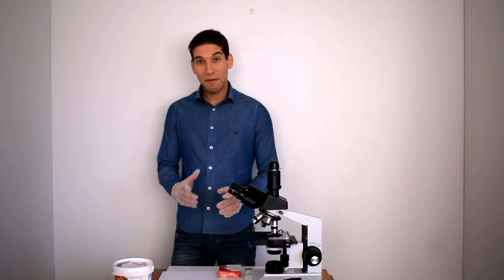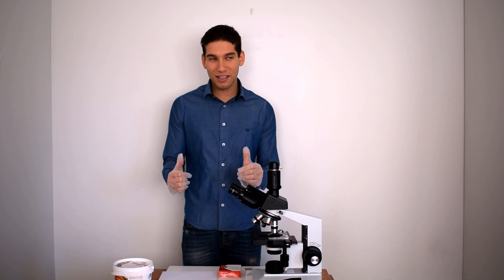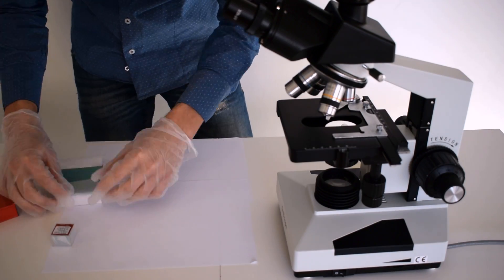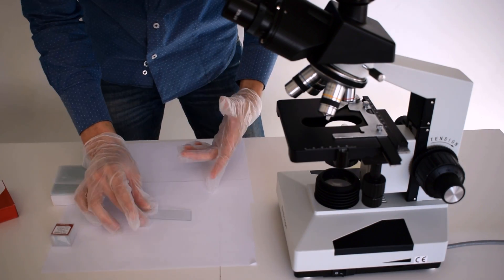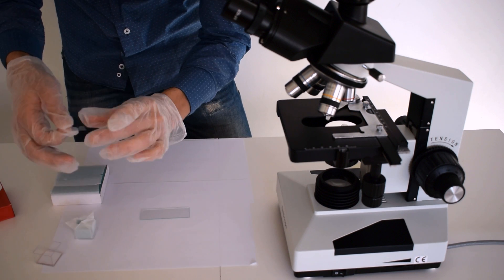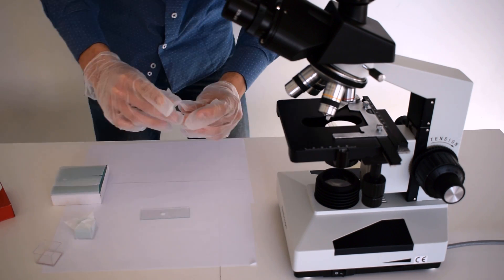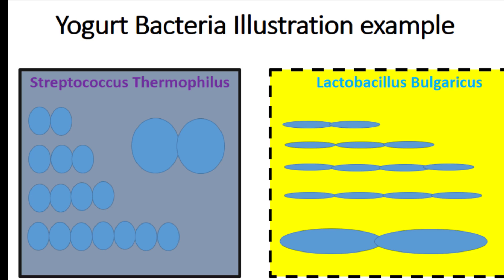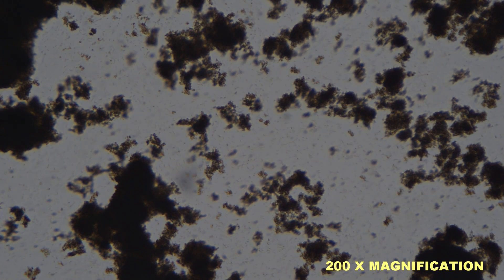Now let's make the microscope slide. I am using this Turkish yogurt that I diluted in water. The reason why I diluted it in water is because it's going to make it easier for us to see and differentiate the different types of bacteria.